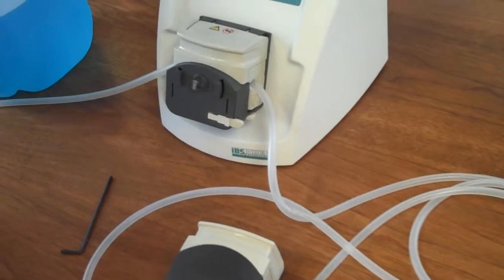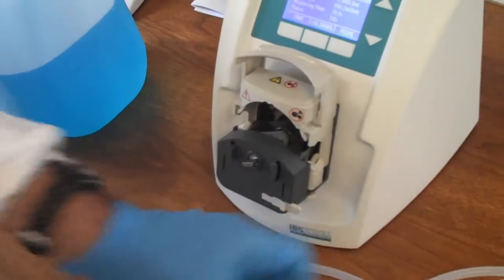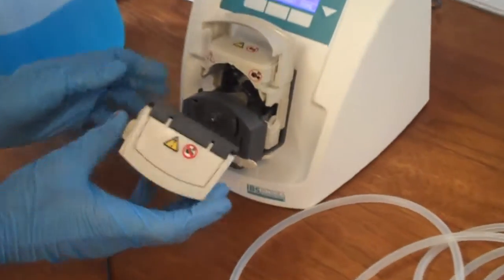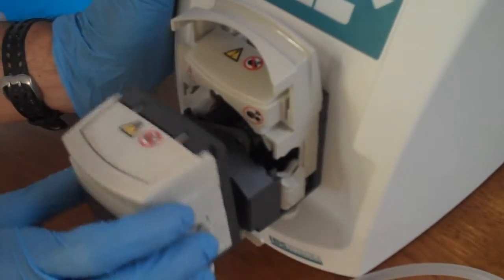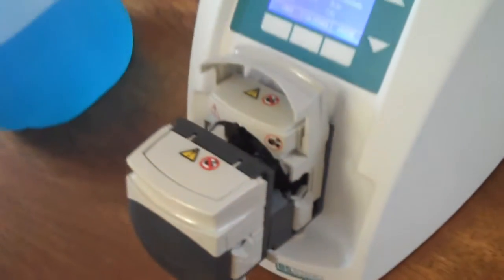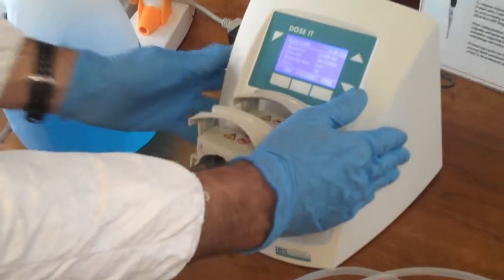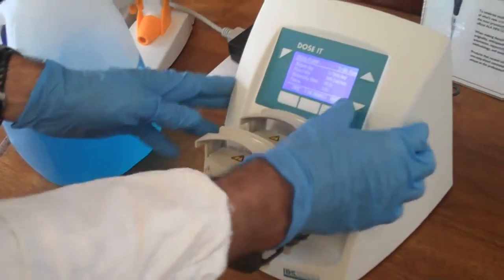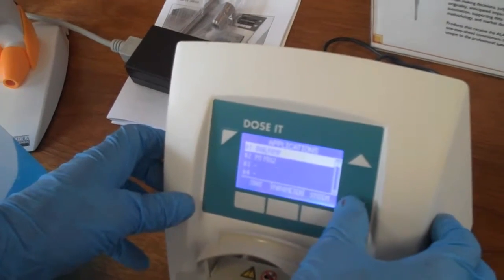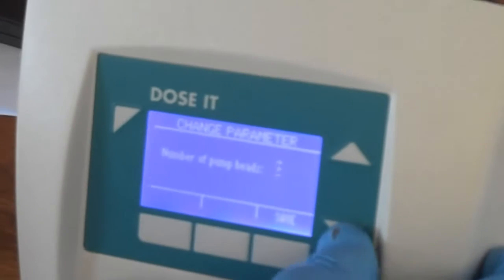Or you can add the second head simply by attaching it to the head that's already in place — it locks into place. And on the main menu, I can identify that I have either one or two pump heads.